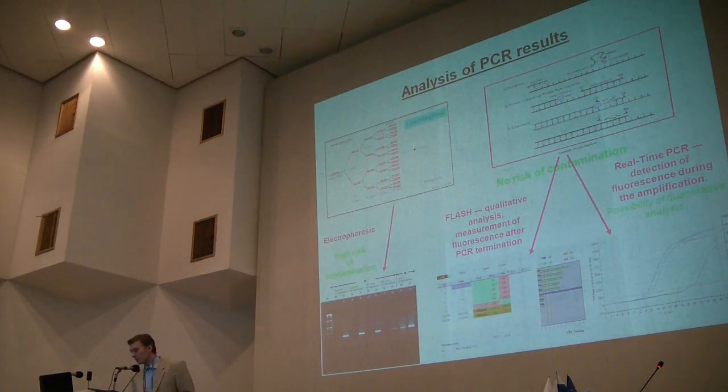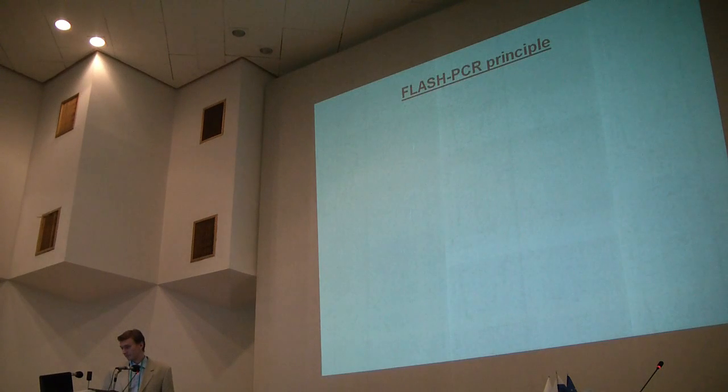FLASH allows the detection of fluorescence after PCR termination without quantitative analysis, just end-point data. And real-time PCR permits quantitative analysis.